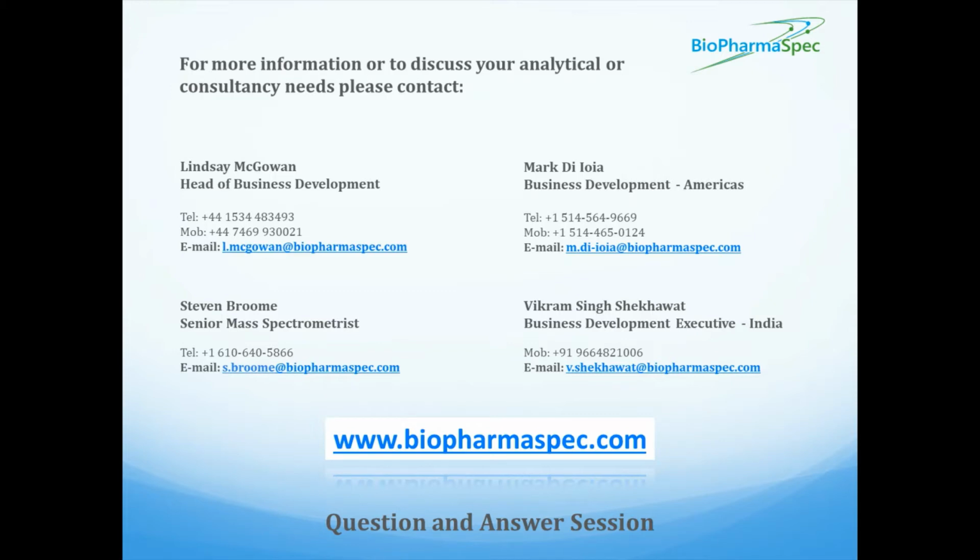All right, thank you. It appears we're running a bit short on time, so this will be our last question. If I needed to, could I use these residual analysis methods for batch release? Yes, you could do these impurity tests for batch release testing. With that being said, though, all the data and assays that I've discussed here today were carried out by BioPharmaSpec, and we're actually not a GMP or GLP certified lab. And batch release testing should be done by a GMP or GLP certified lab.